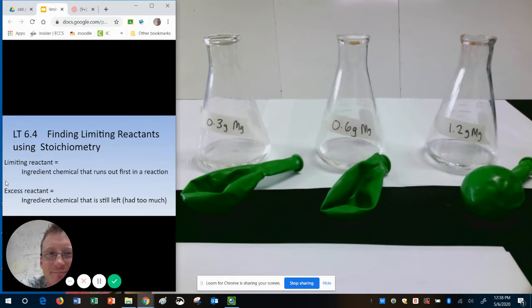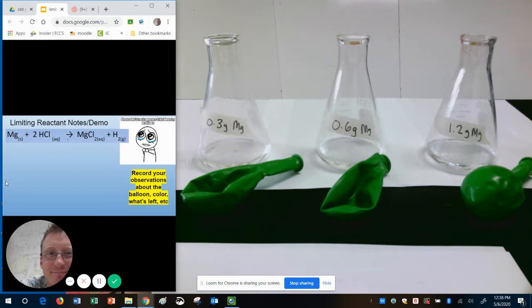Today the reaction we're going to do is magnesium metal with hydrochloric acid HCl. When it reacts it produces a salt magnesium chloride which stays dissolved in liquid and it produces hydrogen gas.